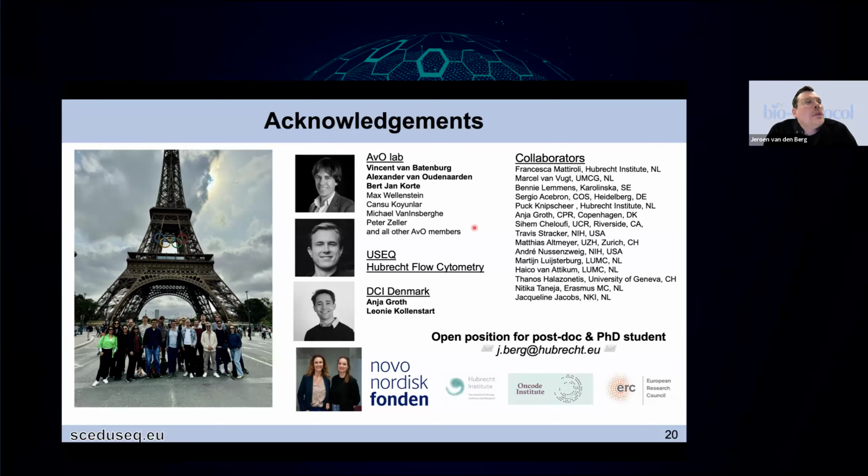We need roughly between 20 and 30,000 unique reads per cell. If you compare that to, for instance, single-cell repli-seq, where the numbers differ between publications, they often suggest going to more than 1 million reads per cell. So that's 40x more.